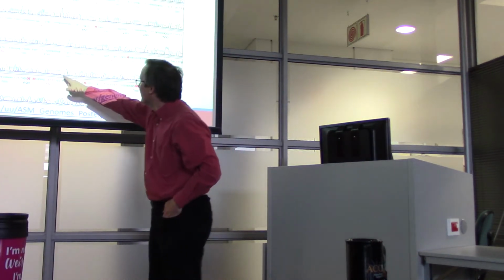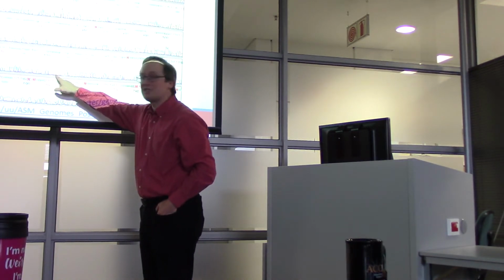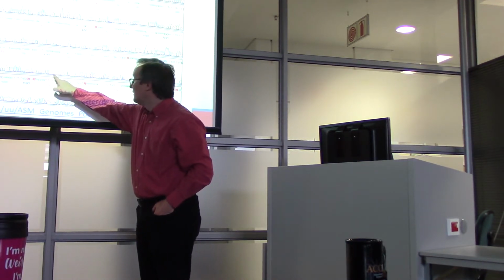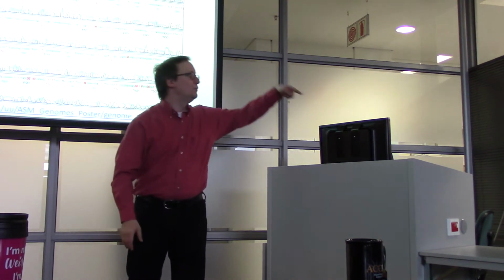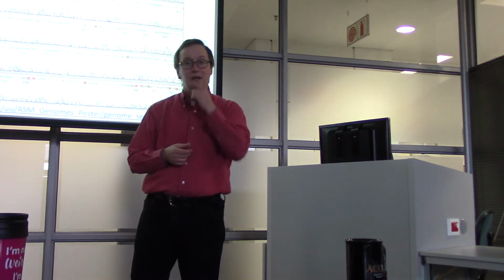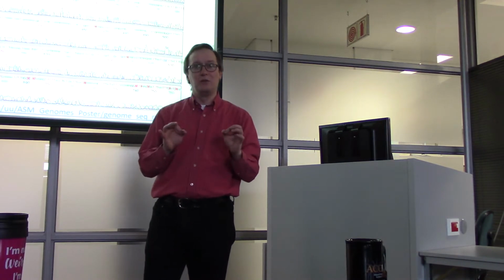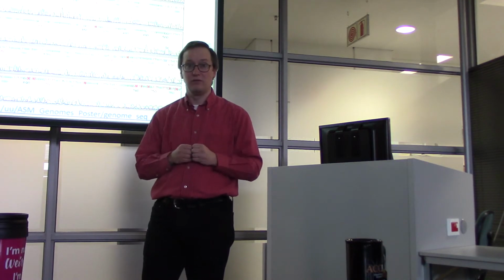When you get up here, look at, say, the stretch about 573. See this run of A's? Does it ever get down to the baseline again? No, you just have this. So you get these unresolved peaks corresponding to individual nucleotides. So it should be apparent to you that not every letter coming from the sequencing reaction is equally well known.